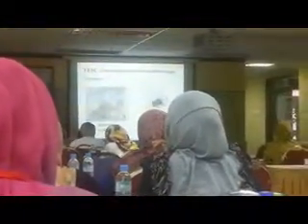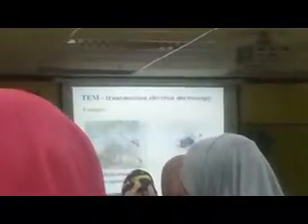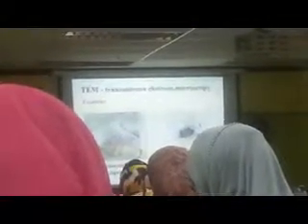You can also see dislocations that got pinned by a precipitate. We always study this in composites preparation, right? When you have a matrix and you have a precipitate, these precipitates improve the hardness and tensile strength of the material. How do they do it? By pinning the dislocation movement. So you can see dislocation loops around the precipitate here, and you can really see it with your eyes and you can believe it. Because most of the time when your lecturer teaches you about dislocation, he will show you an animation made by computer, not the real dislocation, right? But this is the real dislocation, not at atomic resolution, but you can see the line.